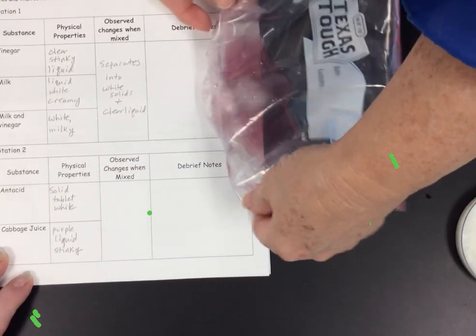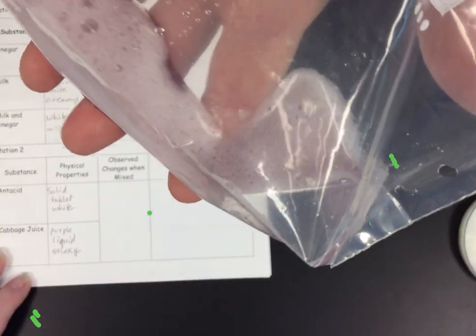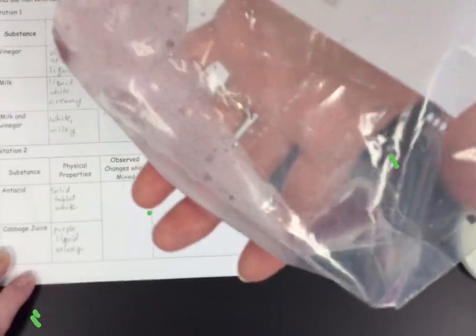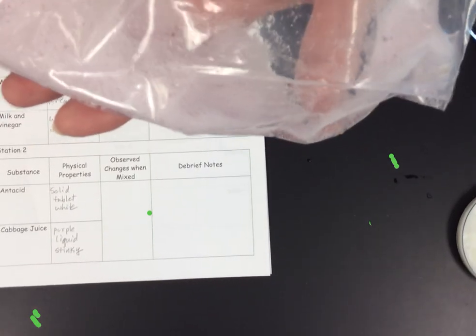This is your observation time. I'm going to try to hold it up for you. You should be able to see that there are some bubbles happening. The bag is kind of cool. I didn't really notice if it got cooler or if it stayed the same. I think it got cooler. I think so, too.